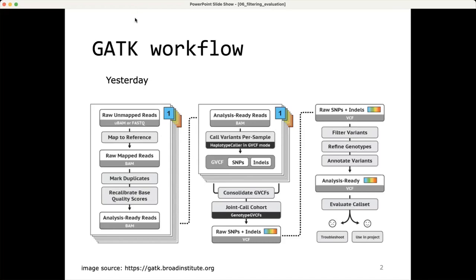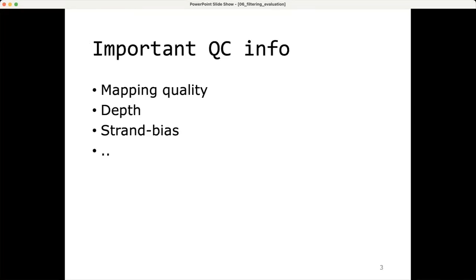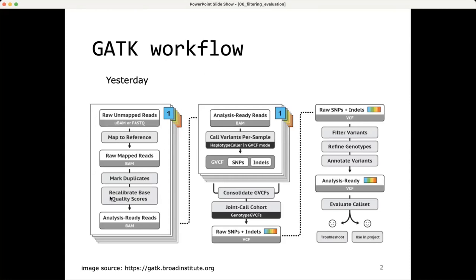So just to show you where we are in the workflow, we have gone through all the mapping, we have created the GVCFs. We have added those GVCFs in a database, so consolidated them, and then we did a joint call. So we extracted all of the information out of the database. And now we have one VCF containing all of the variants in our cohort. So now we basically have the raw SNPs and indels, and we need to filter those, but how are we going to filter them?